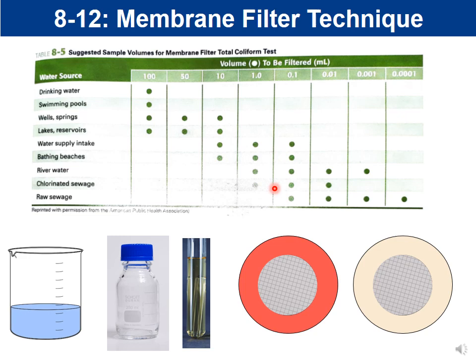And so you would need to dilute this first, because if I took this sample and tried to use 100 milliliters of it straight, there's probably so much contamination in there that on the grid, you're not able to see isolated colonies. So that's why we have to dilute it first. So if I'm doing lake water again, I would transfer the water from here into the water blank. And I would need to make sure that I mix that water blank really well so that it's evenly distributed.